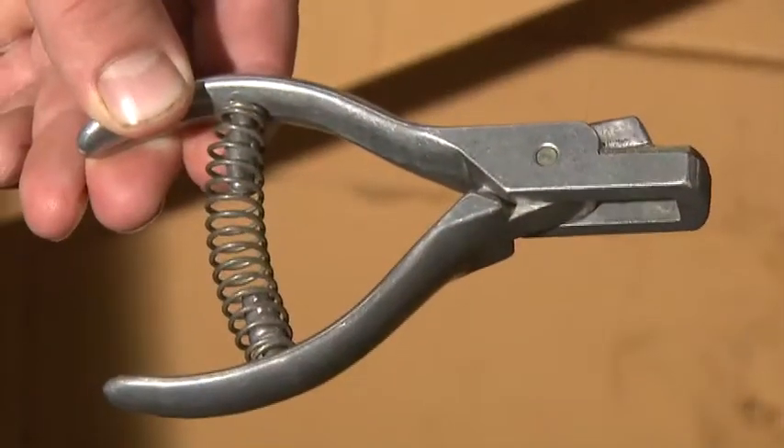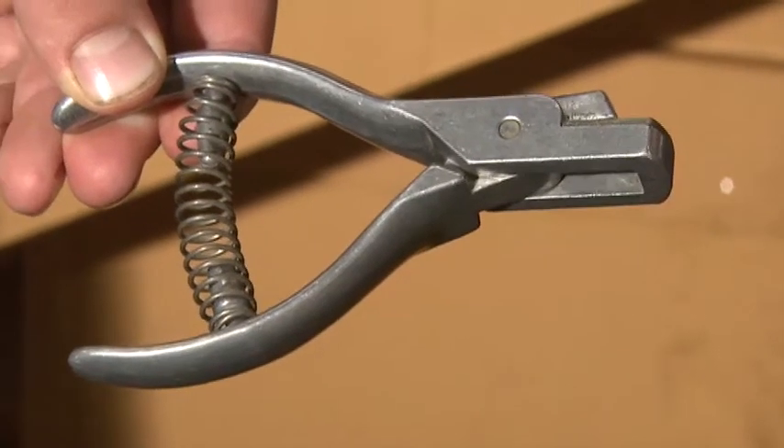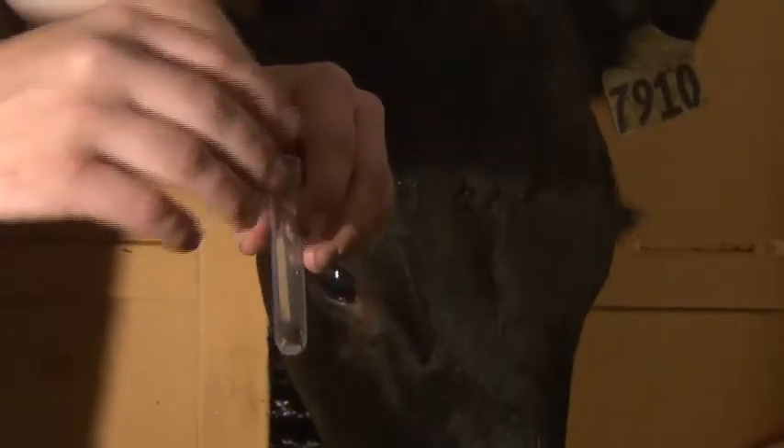The final method of DNA collection is taking a notch from the ear using a pig notcher — a notcher used to ear notch pigs for identification purposes — which works well to take this type of sample from the thin part of the animal's ear. It's just a very small sample that is placed into a tube. A producer could store that sample before sending it to a lab by freezing it in a deep freezer, as long as it is clearly identified with the animal's ear tag, so the sample won't degrade before being sent off.